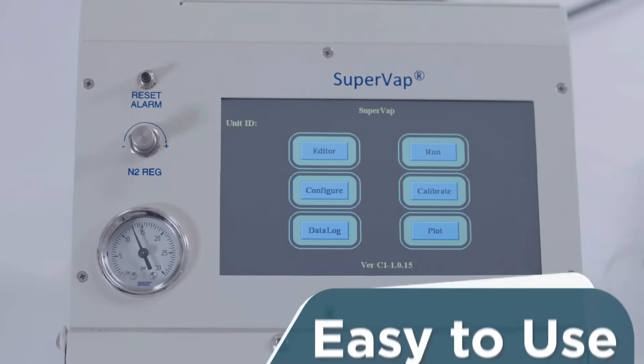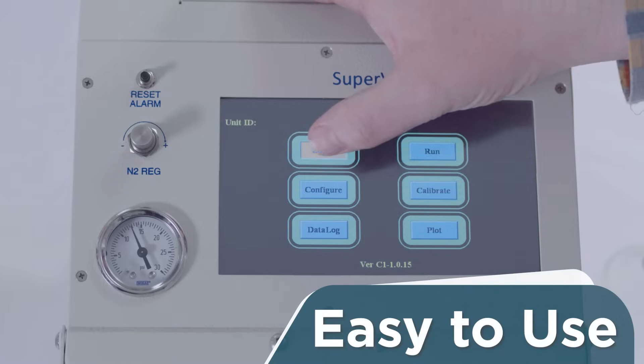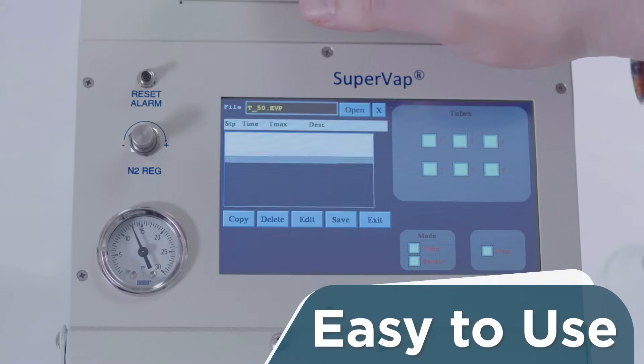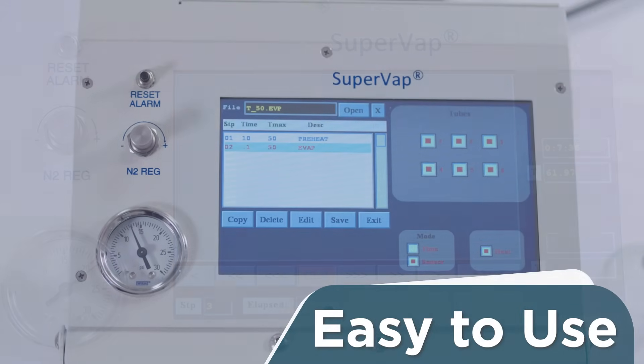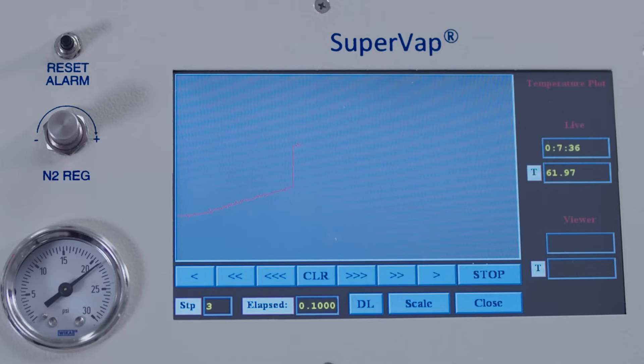The SuperVap uses a touchscreen display for programming, storing, and running methods. Real-time plotting and display of temperature is logged throughout the process. Touch a point on the plot and instantly see the temperature of that point.